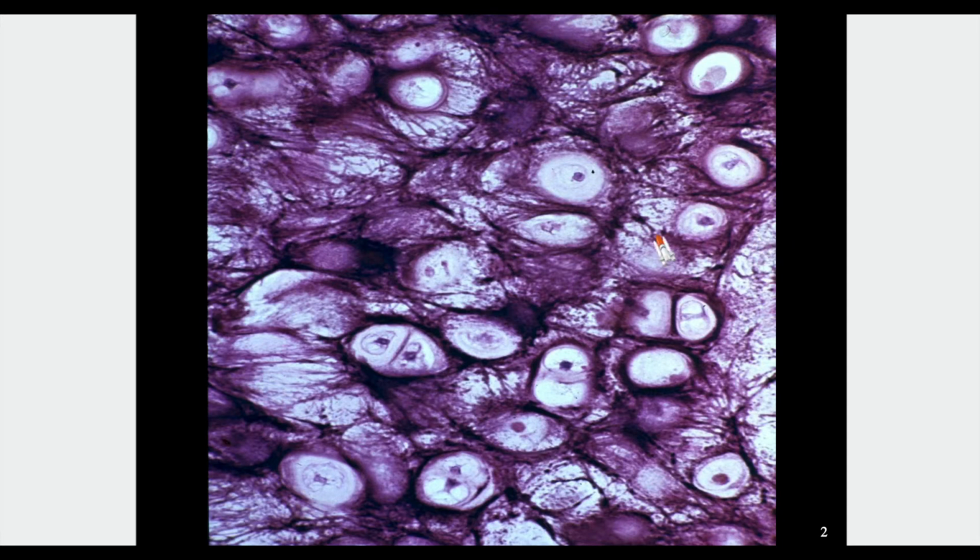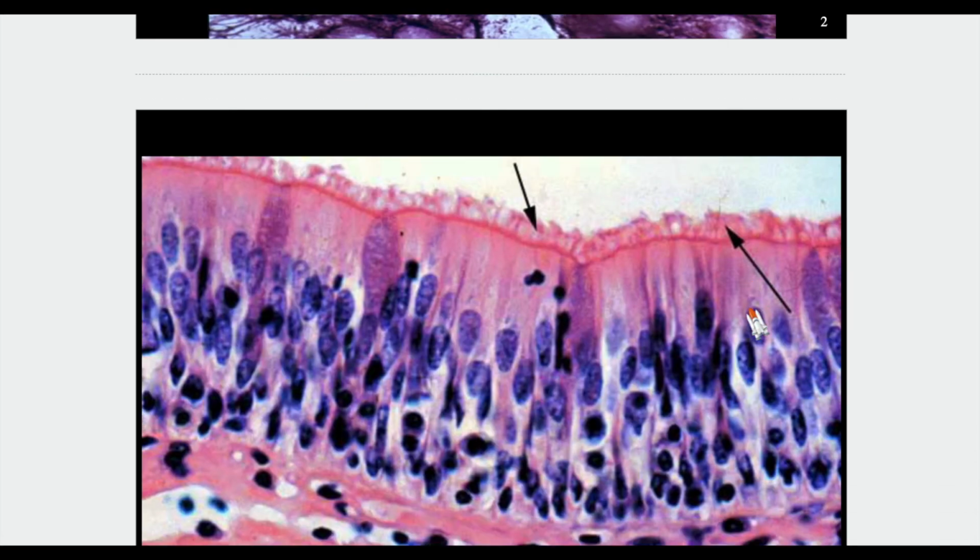I could ask you what those cells live in, or the spaces those cells are in. Remember, those are the lacunae. And look, we have fibers here, right? What kind of fibers are those? Those stringy, thin fibers, elastic. Hey, that's a big hint as to what kind of cartilage you have. So again, that's a great example for that.